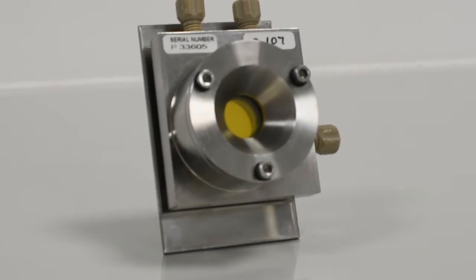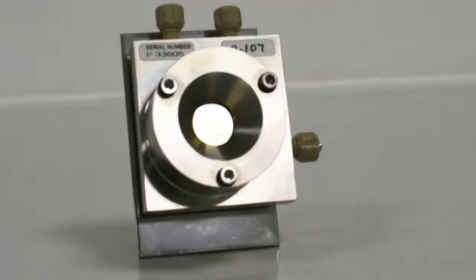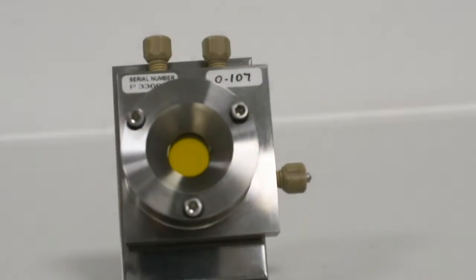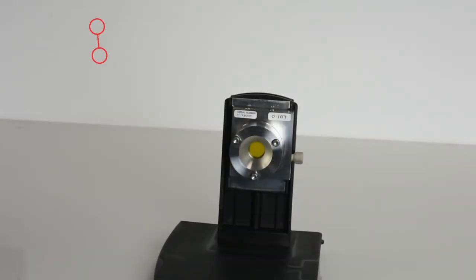The cell has a fixed path length of 100 microns with ZNSE windows and a wedged PTFE spacer to suppress interference fringing. The cell itself can be pressurized to 30 psi, which is approximately 2 bar.